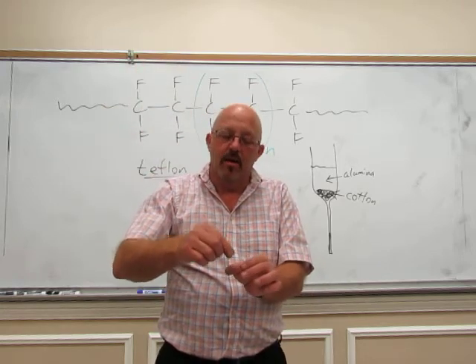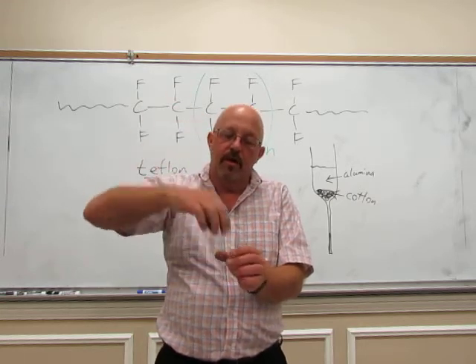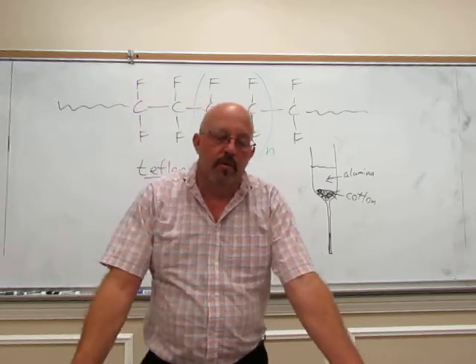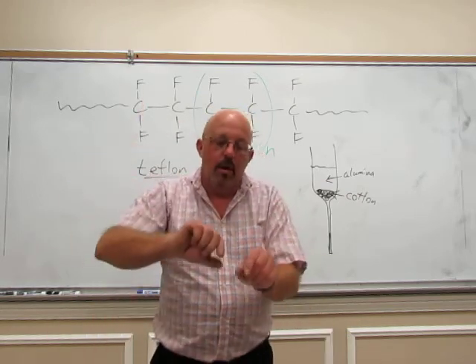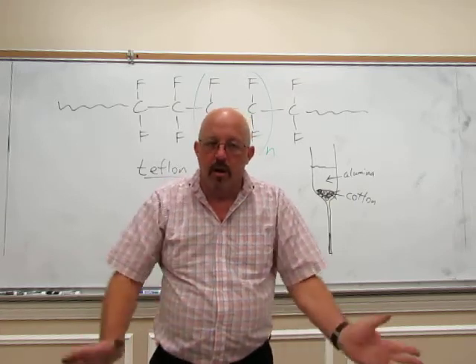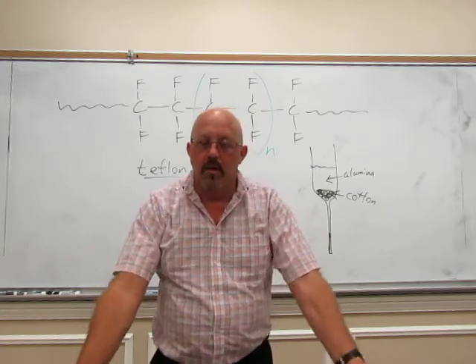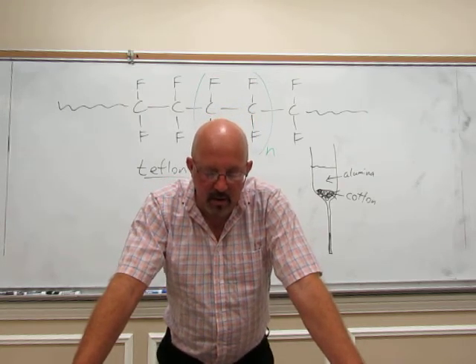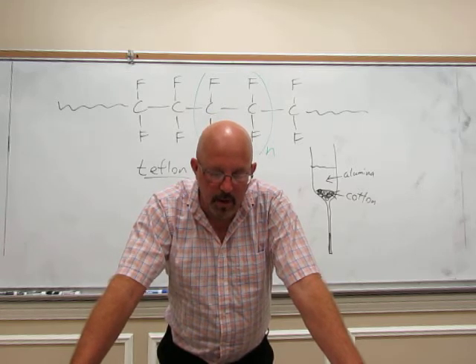But when it gets thick enough, some of it is going to stick to the boiling stick, and as you pull the boiling stick out, it's going to form little fibers. They'll string off of the boiling stick. Allow some of those fibers to cool and test and see how brittle it is. If it breaks very easily, you're done. You've heated it long enough. If it's kind of sticky and gooey, then you need to heat a little bit more. So it should break very easily, some of those fibers that you pull out.